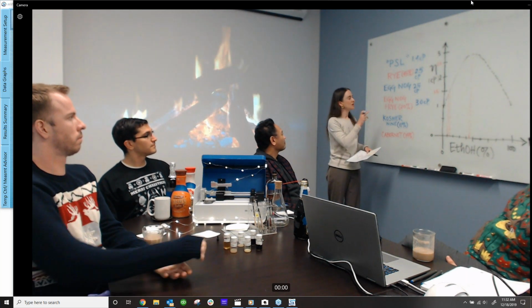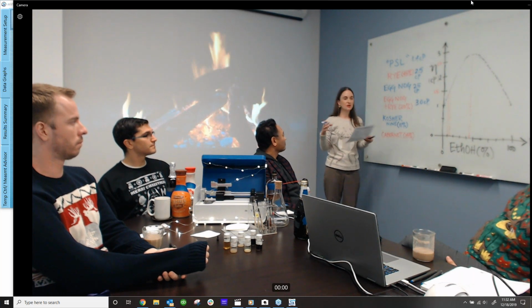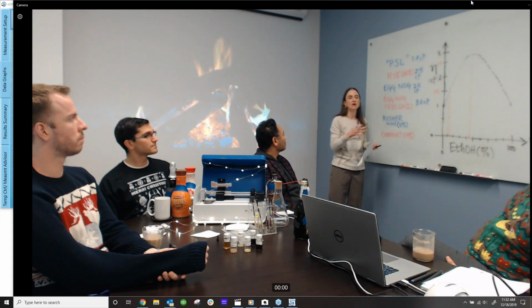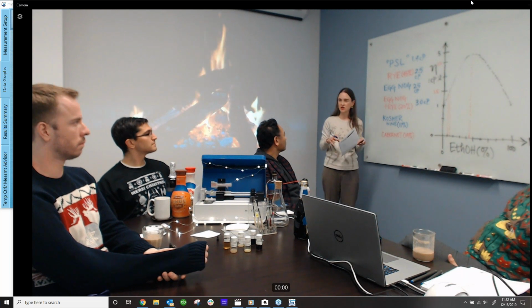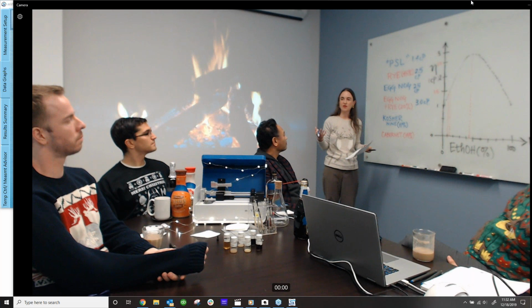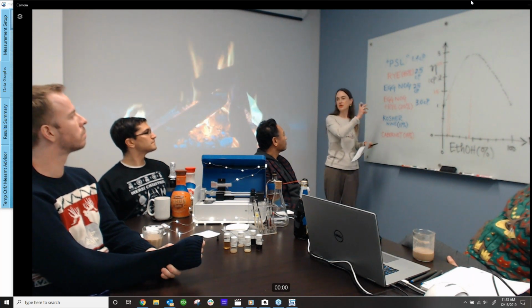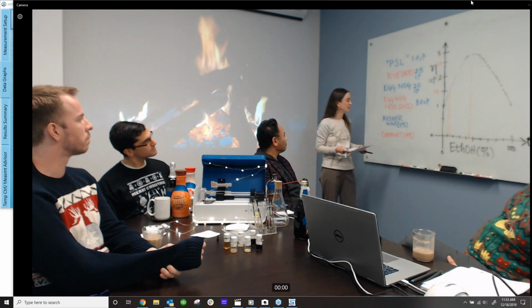And then also, when you have these larger macromolecules like the locust bean gum, their interactions are quite significant, and when you change the environment by adding the alcohol, you can change how they structure, whether they expand or collapse, and how they interact with each other. So this is not beyond the realm of possibility. This is coming from the changes in interactions that you get when you mix the alcohols and then change the environment of these macromolecules. So it's not too unusual.